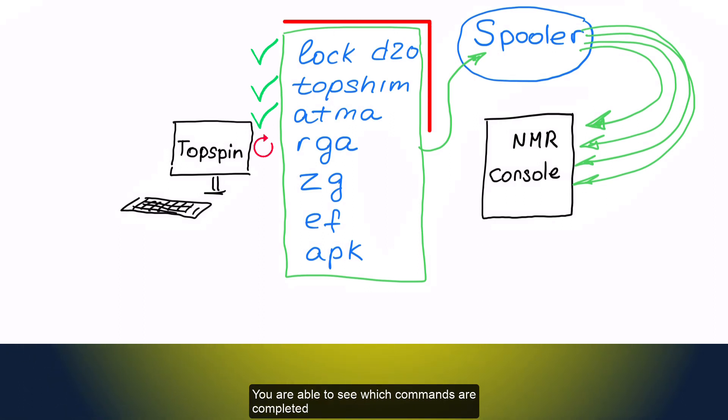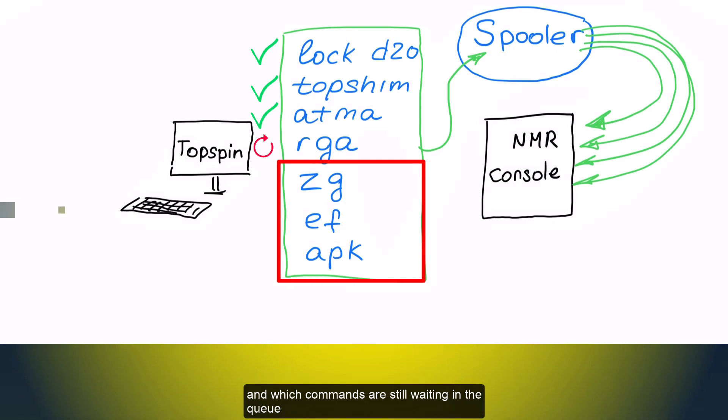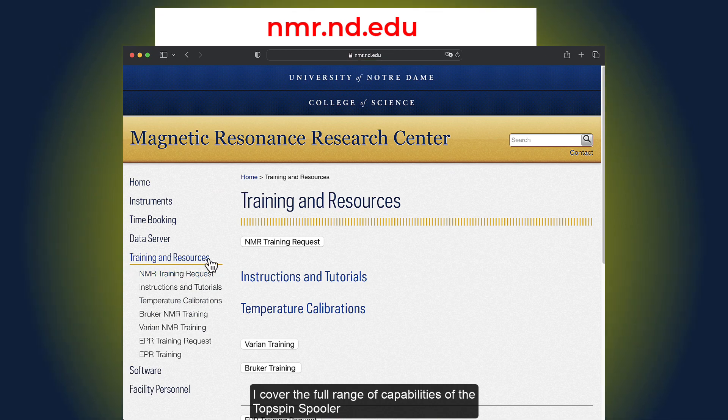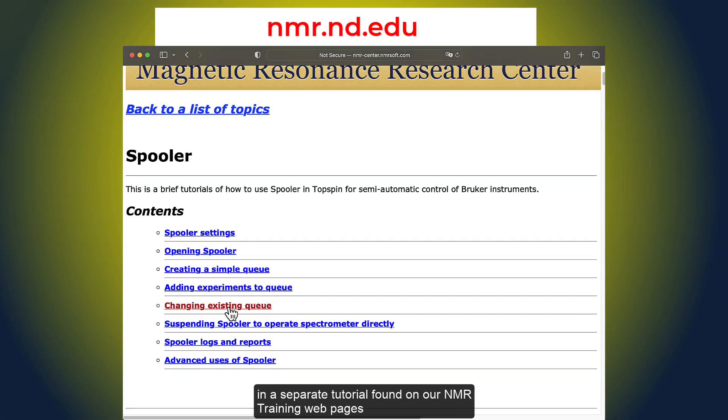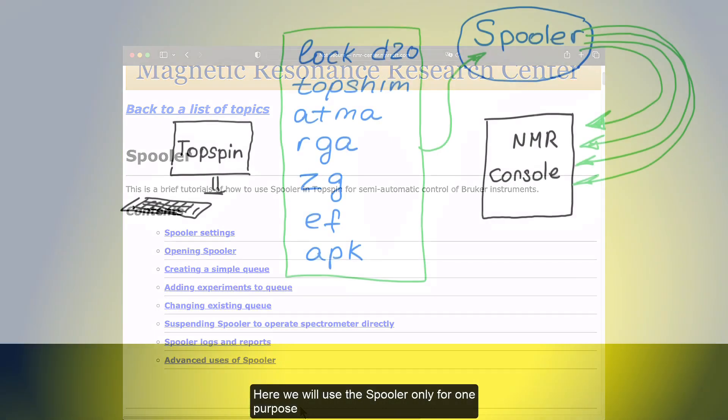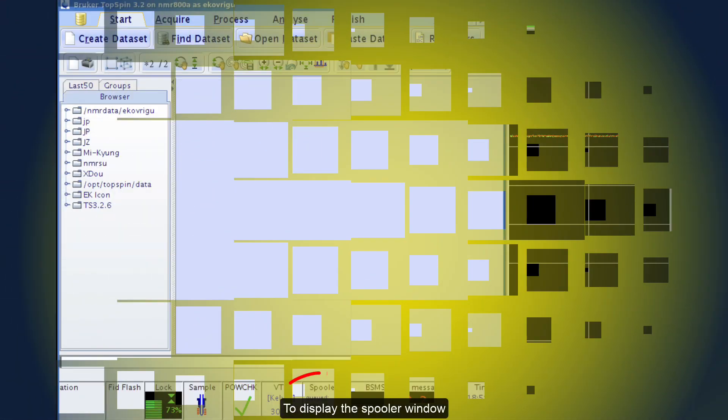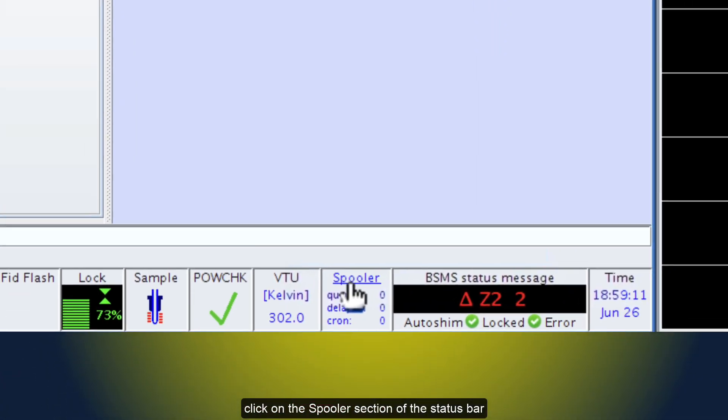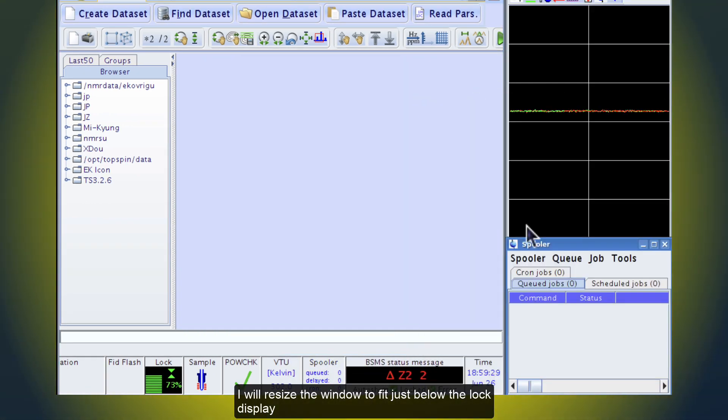You are able to see which commands are completed, which one is currently running, and which commands are still waiting in the queue. I cover the full range of capabilities of the Topspin spooler in a separate tutorial found on our NMR training web pages. Here we will use the spooler only for one purpose. We want to see the progress of tuning and matching and be certain when it is finished. To display the spooler window, click on the spooler section of the status bar. I will resize this window to fit just below the lock display.